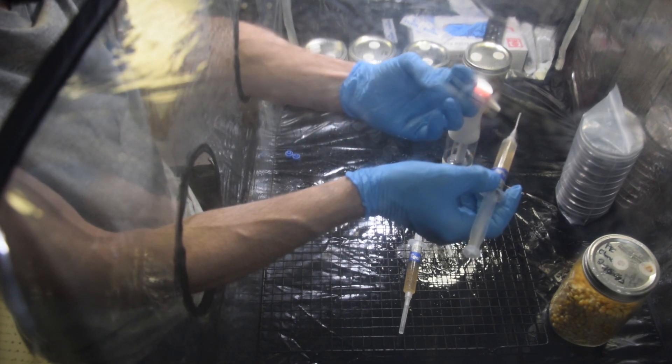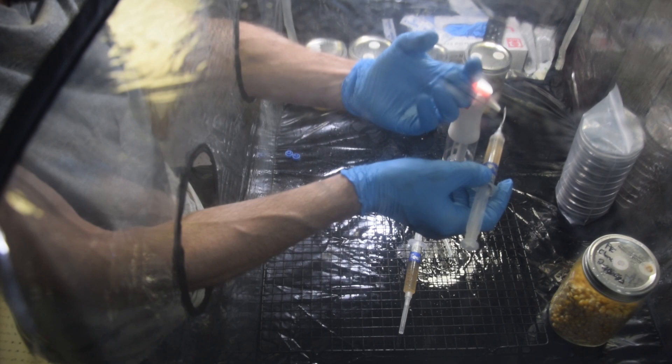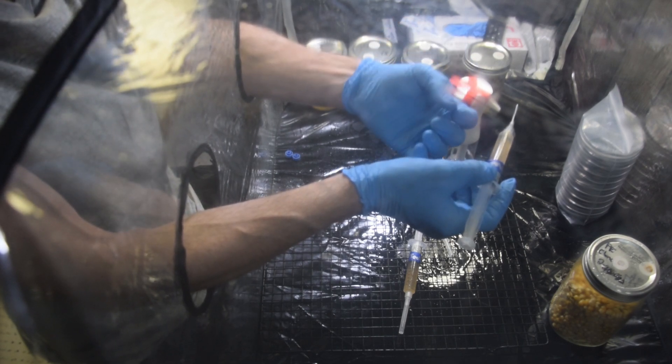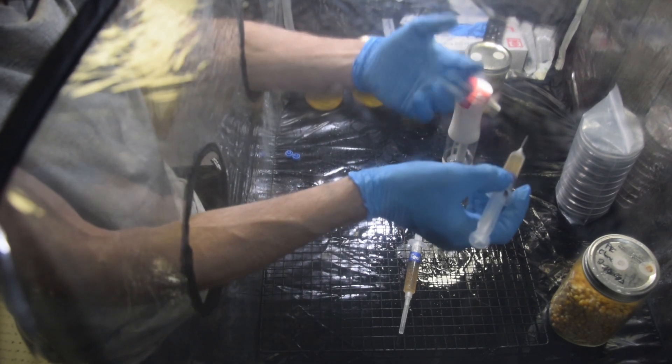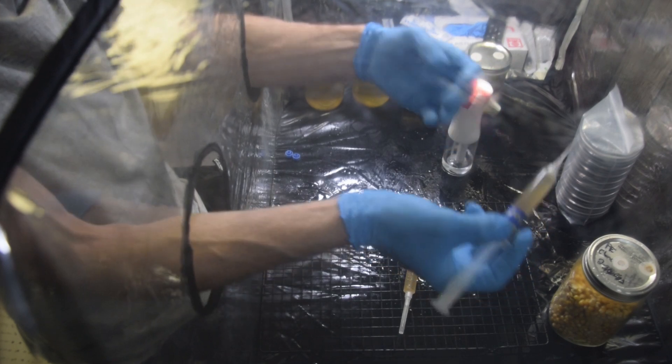Think of it like a syrup — basically a little bit of honey and water, sterilized. Then you inject a little bit of the mushroom into it and it will continue to grow mycelium and spread and spread. Then you use this to put onto your grain spawn.